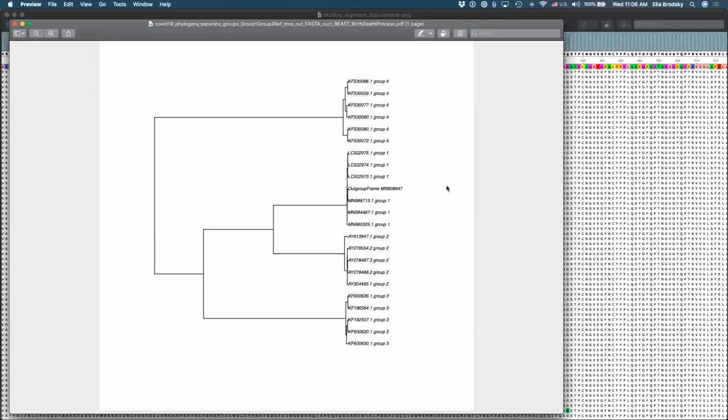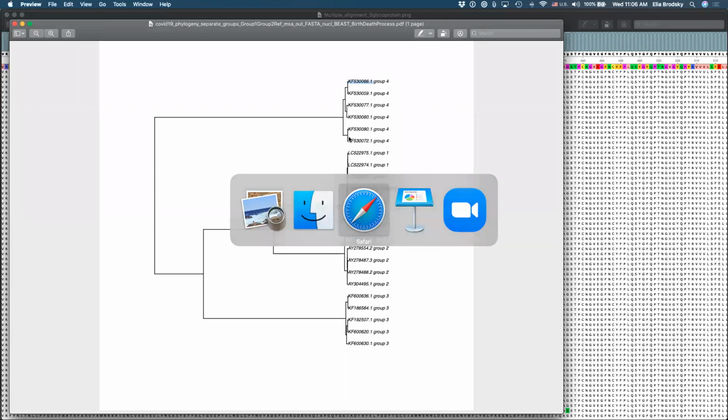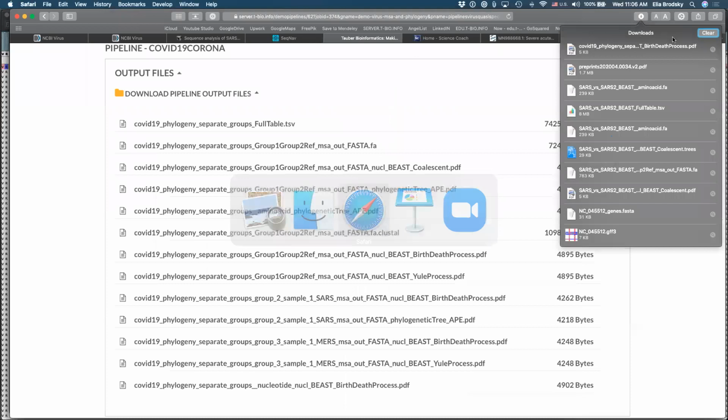Great. Thank you, everyone, for your answers. How do you think I could actually have a sense of what these groups are? Okay, we already analyzed, yeah, accession ID, exactly. So these codes are accession IDs. So let's try and find them real quick to understand what this means.